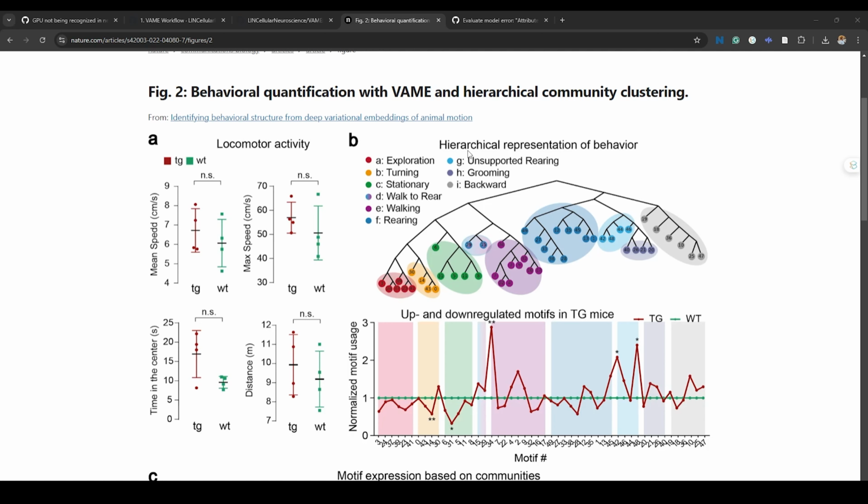For example, if I know one treatment group affects exploration in mice, and the other treatment affects maybe grooming behaviors, right? So I can explore those very easily by having these clusters, that have grooming behavior right here versus exploration right here. So it allows very quick, easy to differentiate representation just from one graph like this.